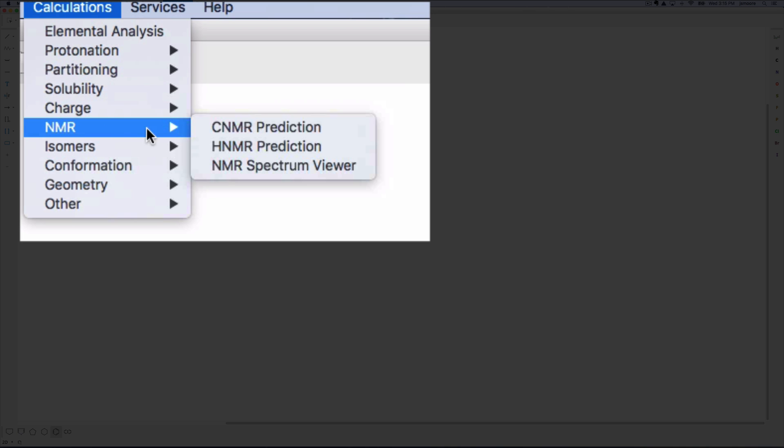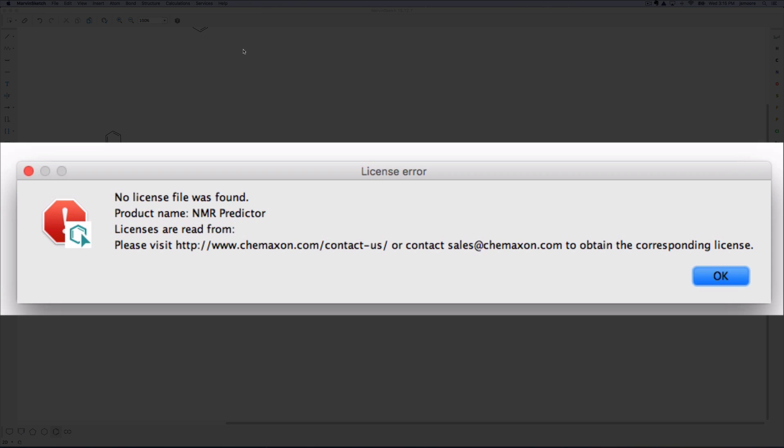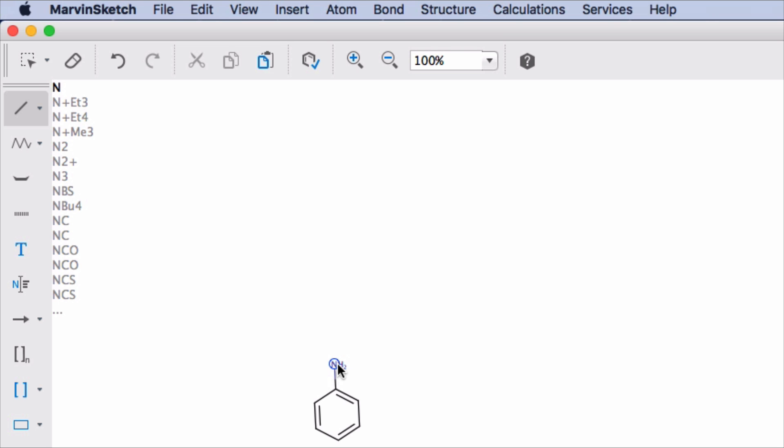Now if I try to use the NMR predictor, a license error is obtained. Some calculation plugins will work without a license. But as you will see in this example, an annoying warning screen appears every time I perform a calculation.